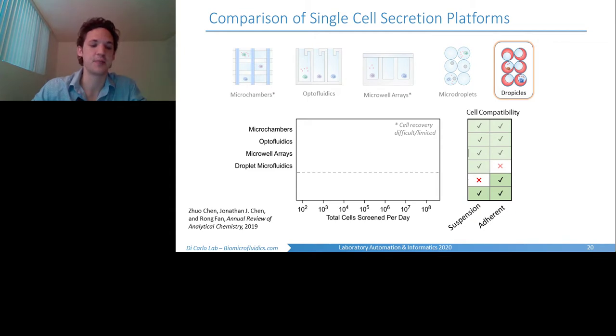Some of our more recent work, and what we project in the near future, is that if we address a couple of things, say, making particles smaller to be compatible with smaller nozzles on flow cytometers, it could increase the throughput of the analysis and sorting step. Improving the efficiency of loading could also significantly bump up our throughput capabilities for screening.